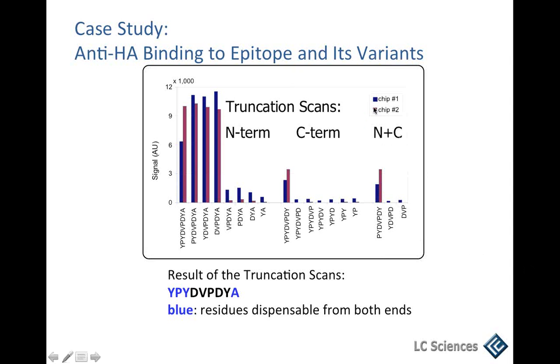Chip 1 and 2 refer just to different probe content on the chips, but these were pretty much the only peptides that were detected. None of the unspecific, unrelated probe content that we had put on the chip was detected with significant signal intensity.